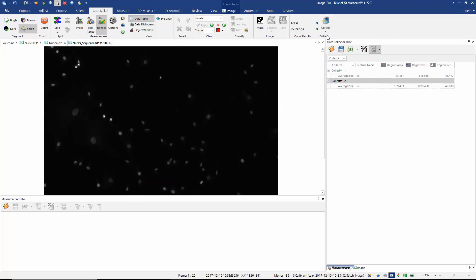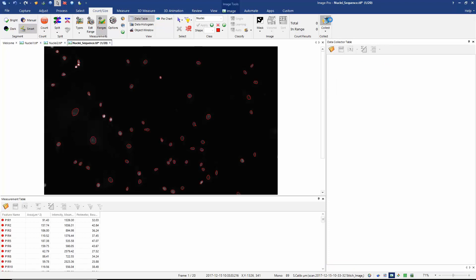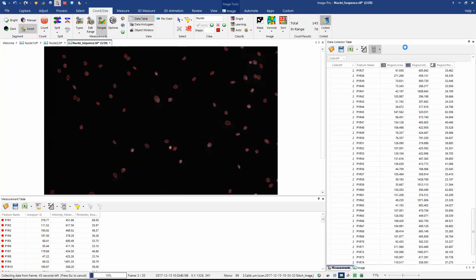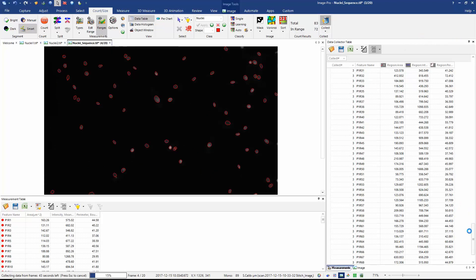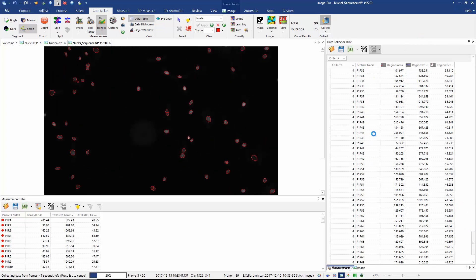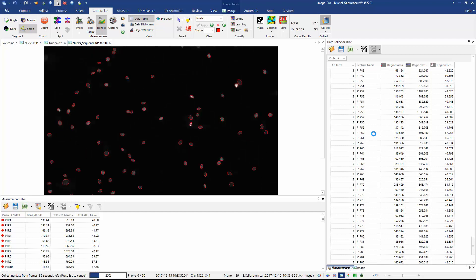Those are the only options I need. So now all I need to do is select collect all frames. When we start you can see that the data collector actually applies my measurements protocol to each frame. And if we take a look at the collector itself we can see that it's accumulating data from each of those frames.